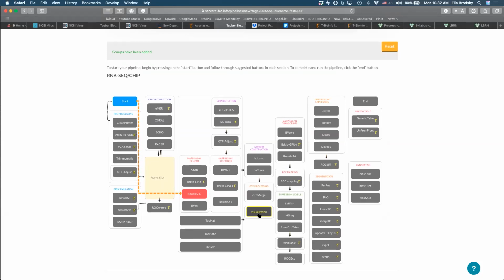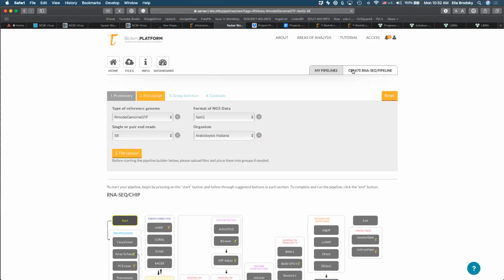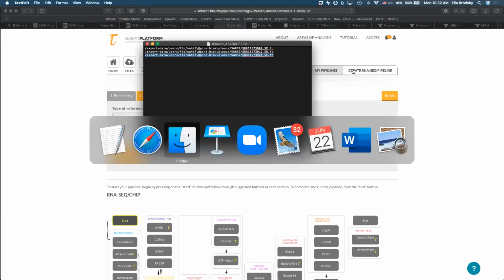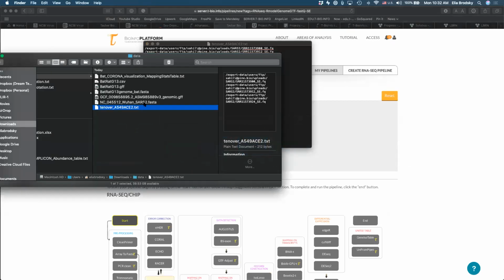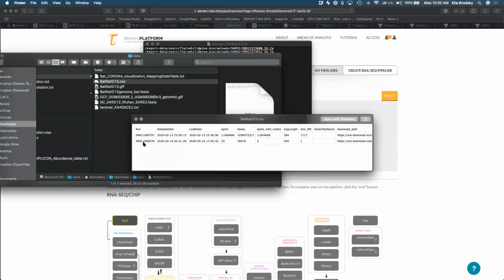So that was example one, right? Example one, we use files that are already preloaded on the platform. Now, instead of preloading the files, right? So let's take a look what else is inside here. We also have this CSV file, right? So the CSV file, and this is more related to, let's see, whose question was it?